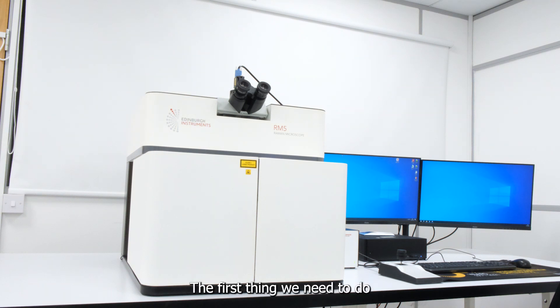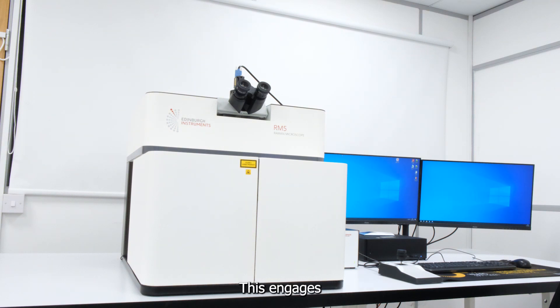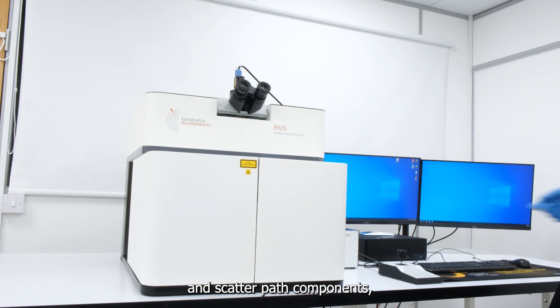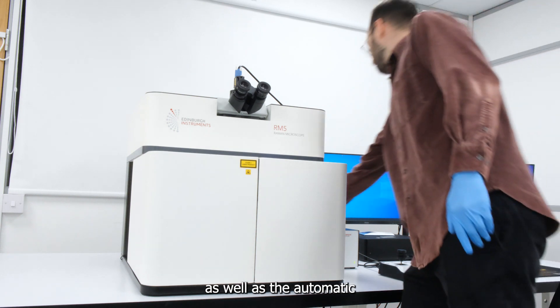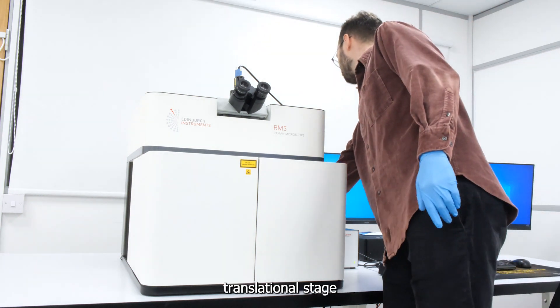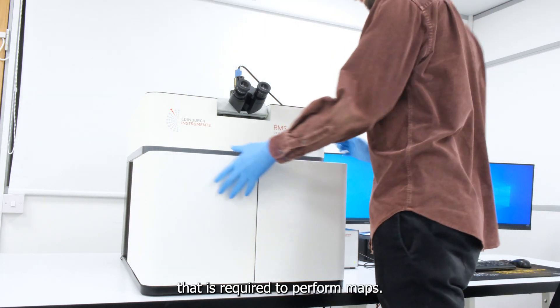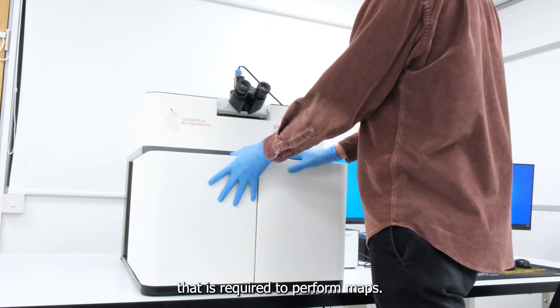The first thing you need to do is turn on the system. This engages all of the internal laser and scatter path components as well as the automatic translational stage that is required to perform maps.